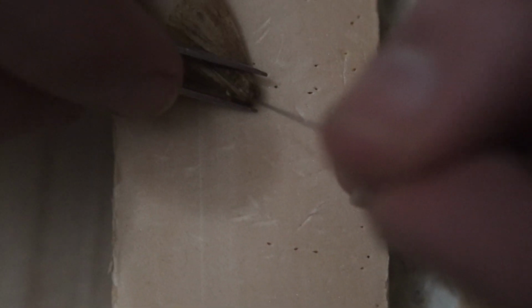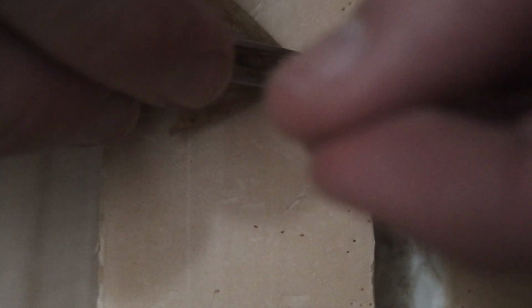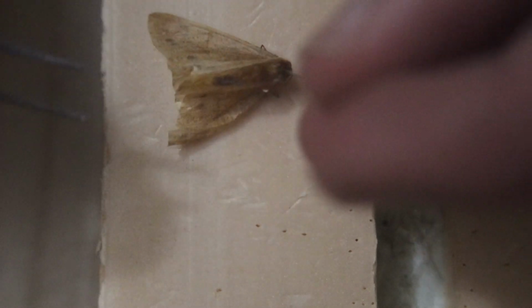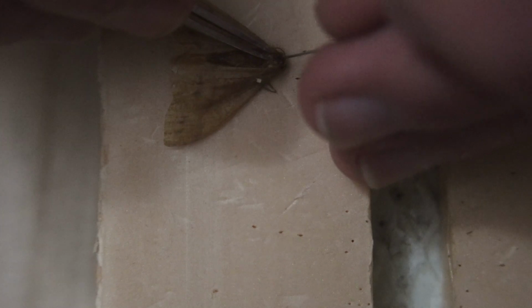I collected this scarce umber quite a while ago, actually, probably over a month ago, and I just kept forgetting to pin it. So I kept relaxing it, and it kept drying out, and then it's the cycle, so there's a bit of mold on it. It's not in the best condition, which I'm a bit annoyed about, because it's quite a cool moth. But, oh well, it turned out alright, apart from what you will see later. So, anyway, enjoy the video.